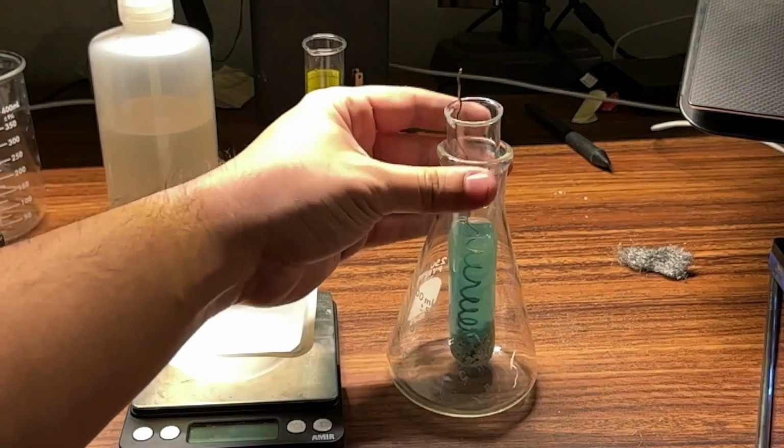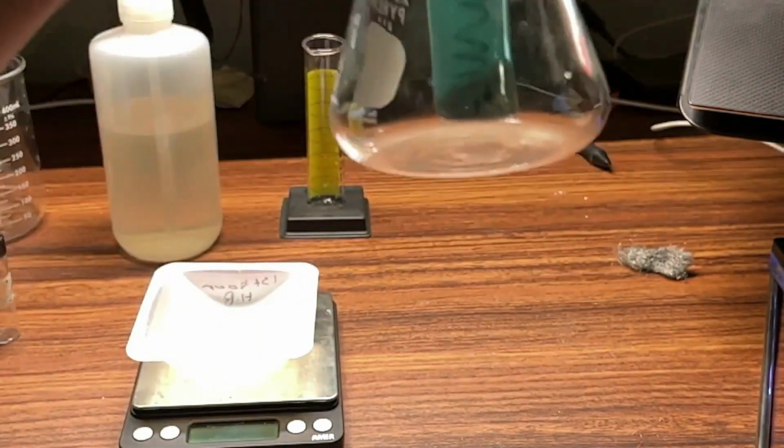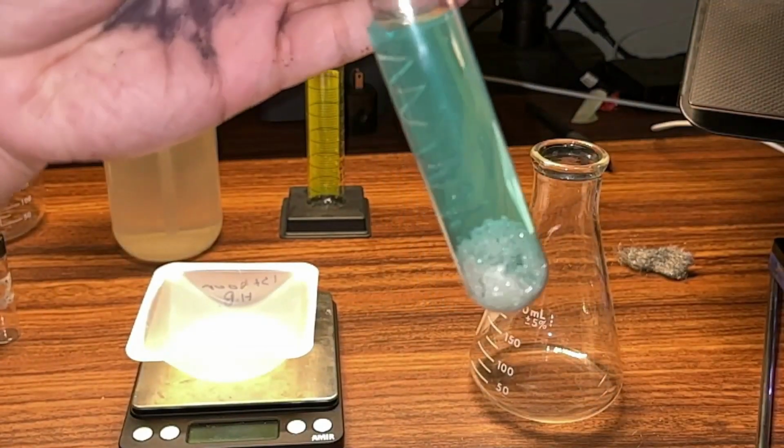Okay, I think there's technically more silver still in the solution, but I'm kind of tired of doing this and I want to move on with my day. So we're just gonna call it there. I got a lot of silver out. Look at all the silver crystals there at the bottom. See, so that's quite a bit of silver that we recovered.